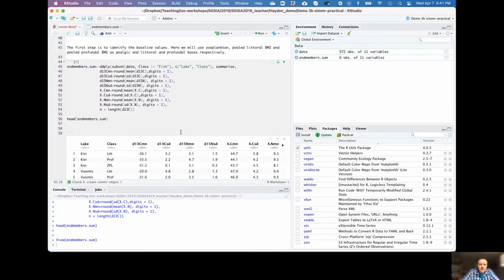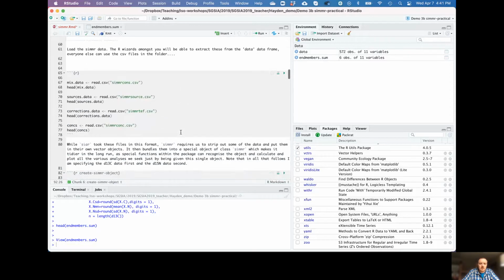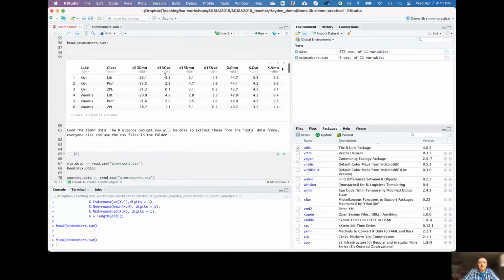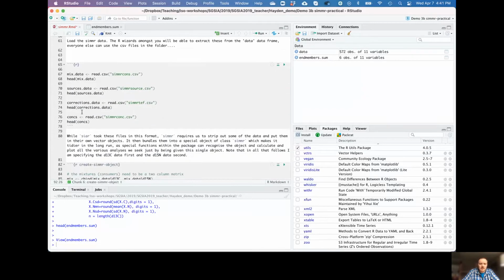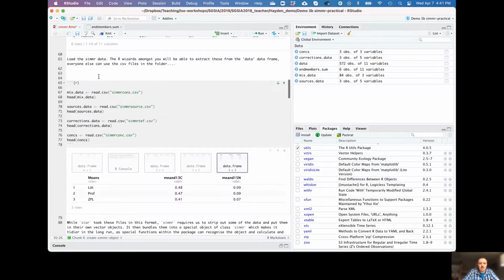So what we need to do is scroll down to the next part. That's our data, and that's essentially what we've made our input files from. These are the input files we had a look at earlier. If I run this, essentially we're picking up each of those input files, importing it into R and giving it a name.